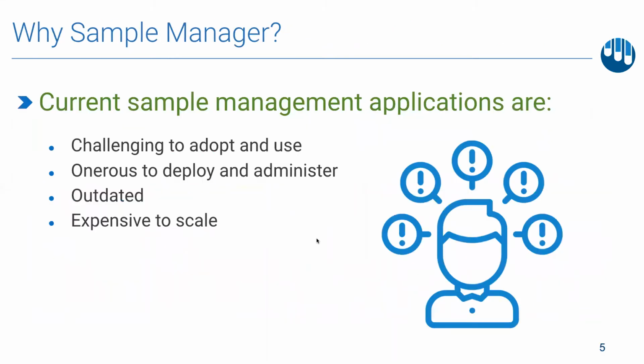We started our investigation for Sample Manager in 2018 and found that although there are many sample management solutions out there, current products tended to be hard to use, difficult to deploy and administer, lacked modern interfaces, and were cost prohibitive either at the time of purchase for enterprise level software or after adoption when groups were trying to scale.